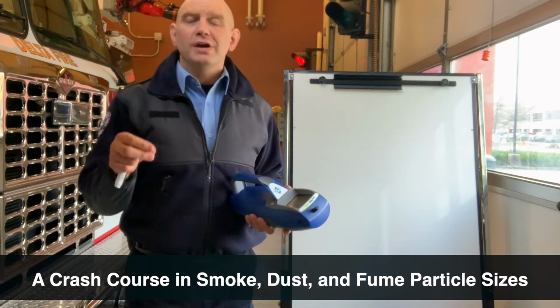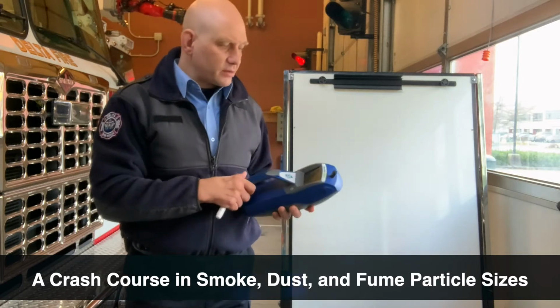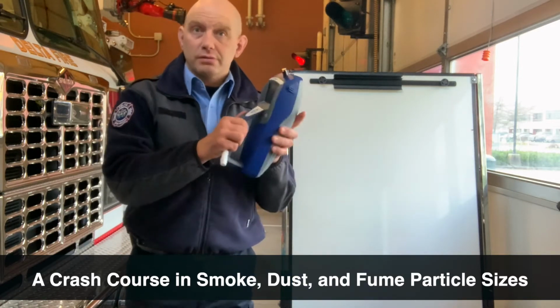Okay, the goal of this video is to give you enough information to allow you to use a particulate detector such as this DustTrak DRX detector.